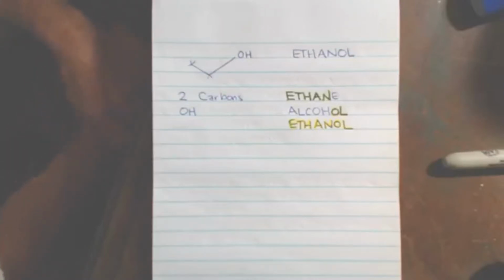Keep in mind that when you dry this with the Epsom salt, or magnesium sulfate, a grain or two, very, very little magnesium sulfate will dissolve in the ethanol. So if you don't care about that, but you want it dry, you'd have to leave that in there for at least a couple of days to dry it.